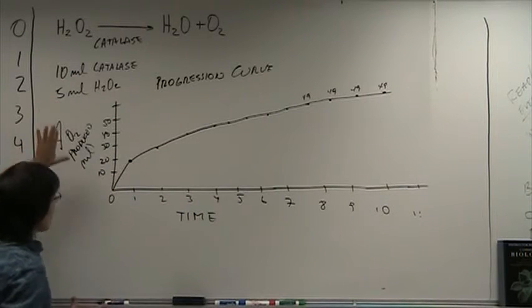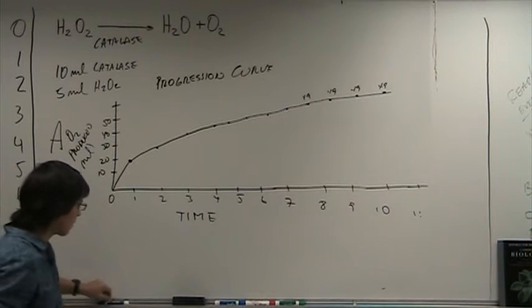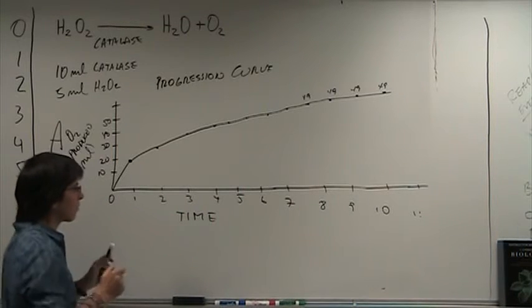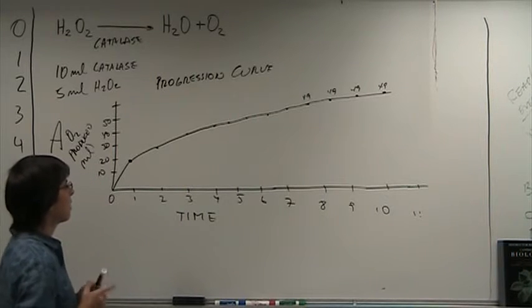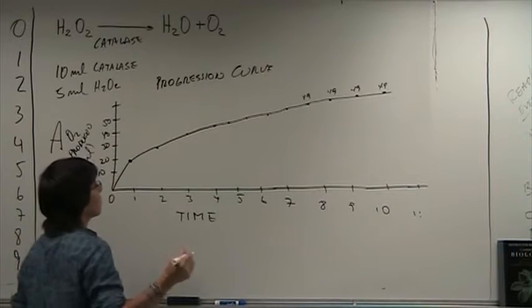Now, the main thing to do in this part, you have to be very comfortable calculating reaction rates at different time intervals to see how the reaction progresses. So you have to do that in your lab. Please follow the directions. I explain everything very carefully, but just in case, reaction rate.